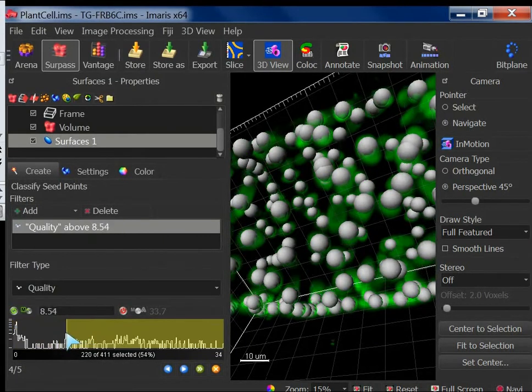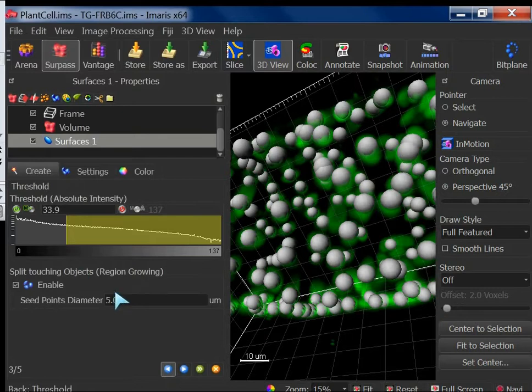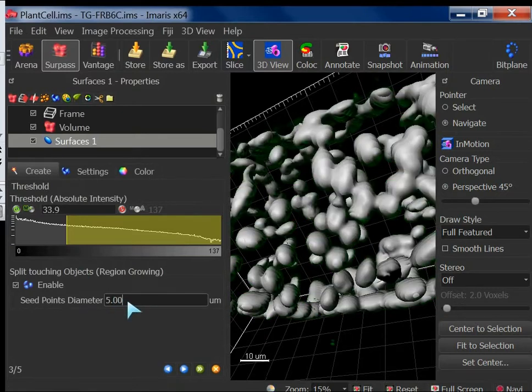So if it is not coming, and that is what you wanted and targeted, then you have to go back and change your size. And at some point you will get that candidate. So it's very back and forth. You have to go back and forth, because there is no automatic way of deciding what should be the size of the seed point.